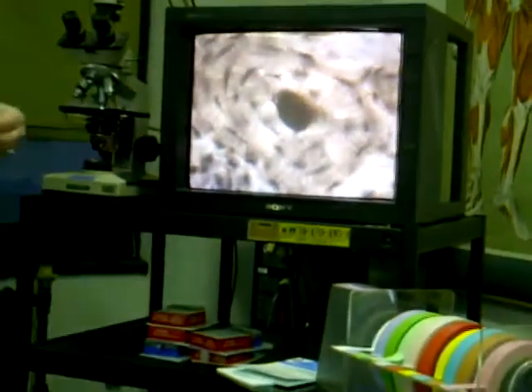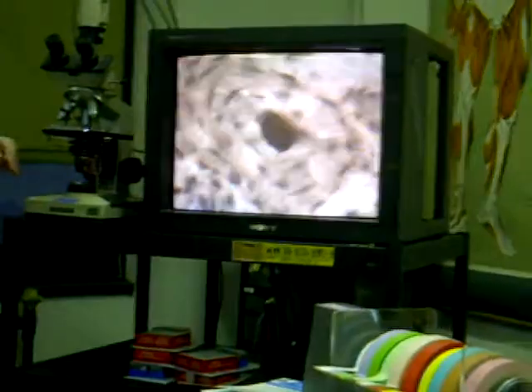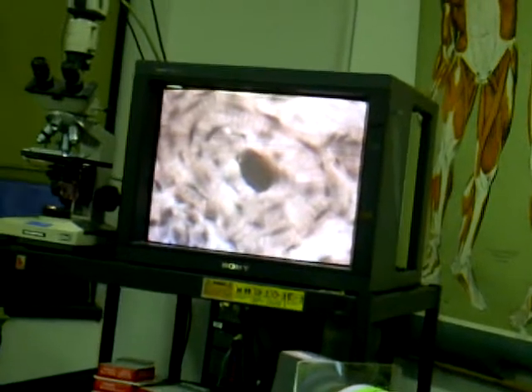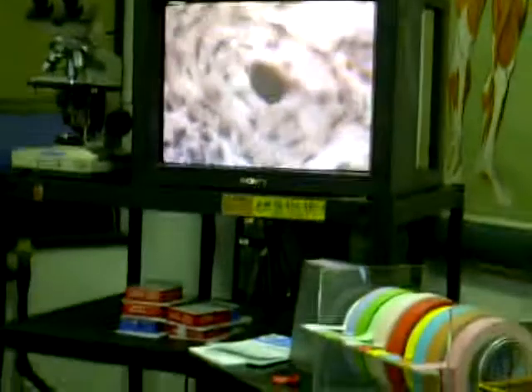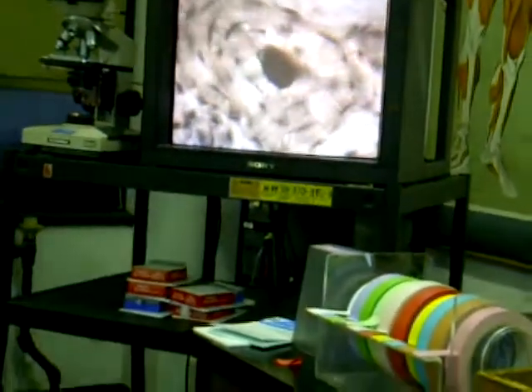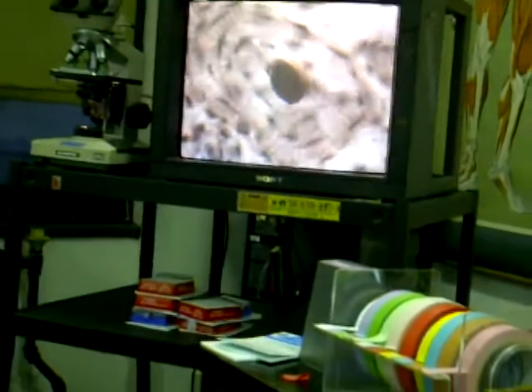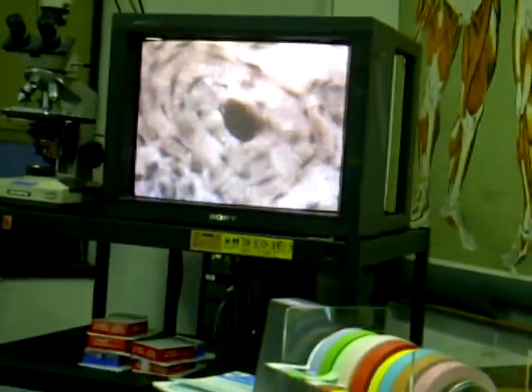One of the slides that you don't have, oh man, this specimen's gone, it was a longitudinal section. Oh well. That's one you dropped. Or it went on the floor. It looks like the cover slip is broken. I'm not sure if that happened now or if it was like that. We have a few of these. I guess we'll just have to be happy with the cross section.